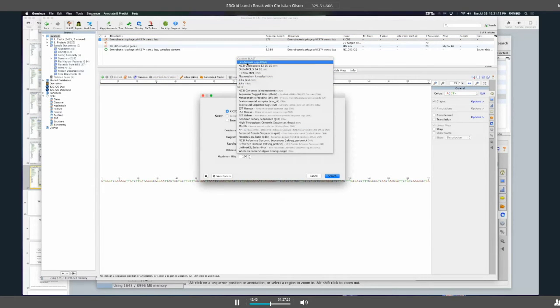So in this case, I've got Leishmania species DNA custom BLAST database set up on my local machine. I've downloaded all of the Cyclospora sequences as of 12/15/15 from NCBI. I downloaded a version of OrthoMCL, and so on and so forth. Okay, so this is where your custom BLAST databases are going to be listed, and this is where you're going to choose which database you want to use. If you want to use the public resource, the public NCBI resource like NR or EST mouse, or if you want to do PDB sequences, which is another public resource, then just select those from down here.